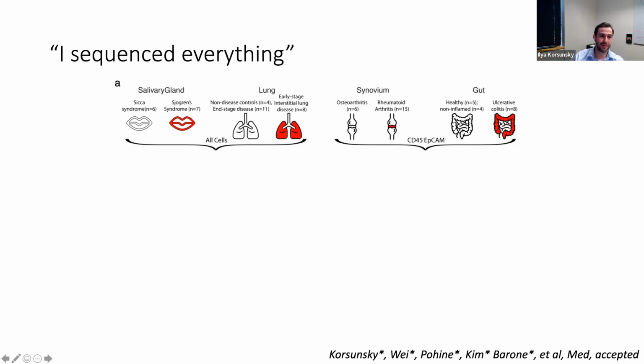So maybe to go back to Bob Weinberg and the hallmarks of cancer, right? You can see this population.